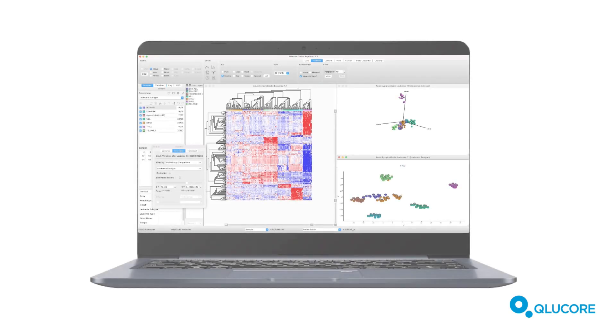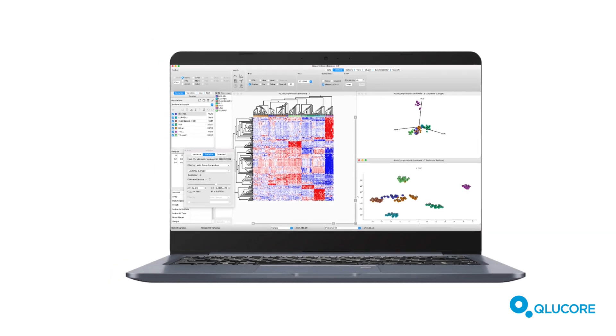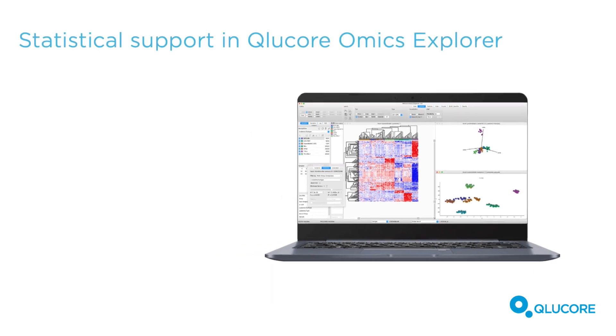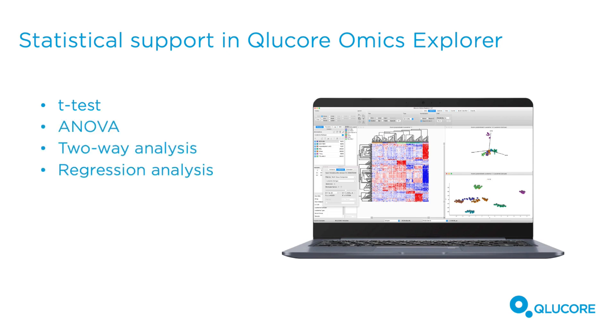You're expected to be familiar with the basic functionality of Qlucore Omics Explorer and the user interface. Qlucore Omics Explorer includes a wide range of statistical tests such as T-Test, ANOVA, two-way analysis and various types of regression. The Extended Statistics mode supports methods such as Welch, Mann-Whitney, Kruskal-Wallis and LIMA.